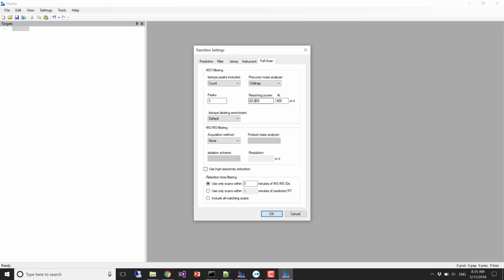At this point, most of us look at Orbitrap data with centroided spectra. In fact, our lab has started collecting DIA data in centroid only mode. It leads to much smaller files. Definitely, I know that people using Bruker instruments are doing that because Bruker has really huge profile data.